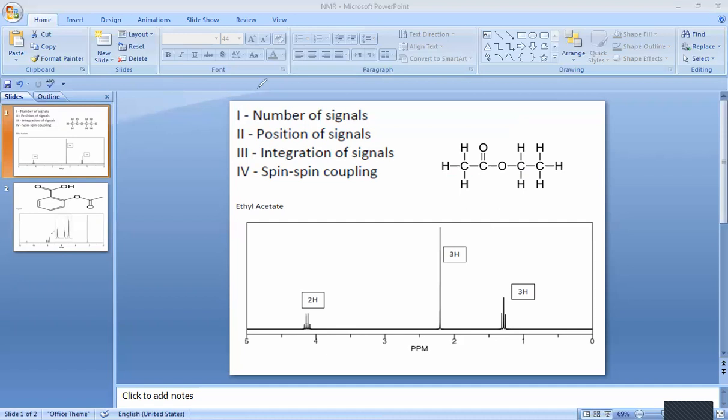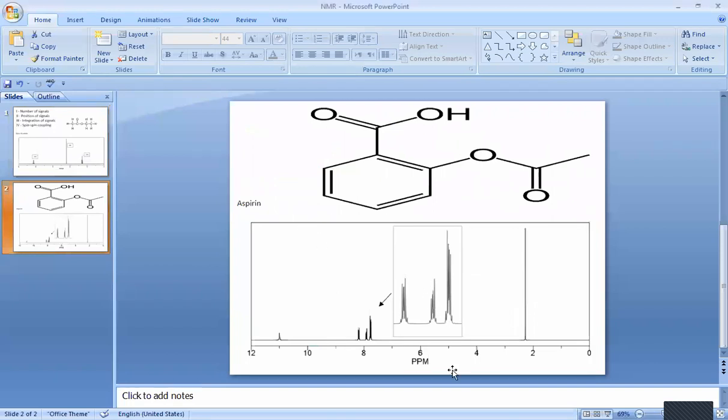And for the second one that I want to go to, how to annotate this is difficult. Okay, so going here, the second one is about the aspirin, how to do the analysis of the aspirin. Again, let's annotate. So I think this is not a very complete picture of the NMR, but let's do a very rough estimate of the things that we have.